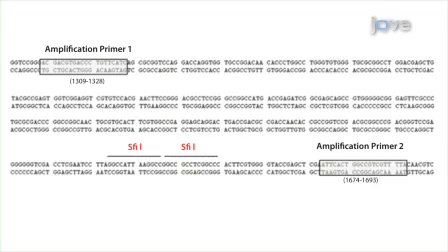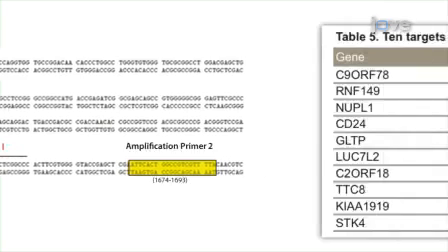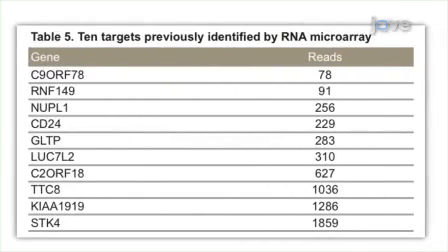The cDNA containing microRNA target sites are then PCR amplified using the Target ID amplification primers in order to sequence and identify the microRNA library targets. Ultimately, results are obtained that identify specific microRNA targets in cells based on deep sequencing analysis.